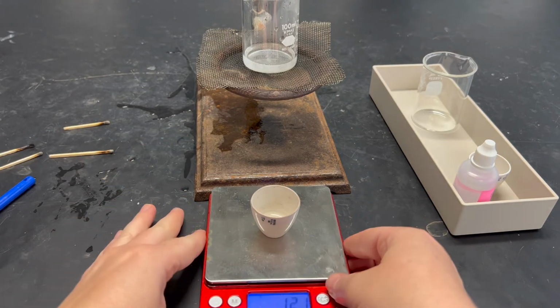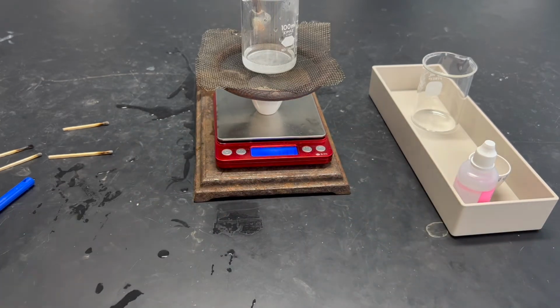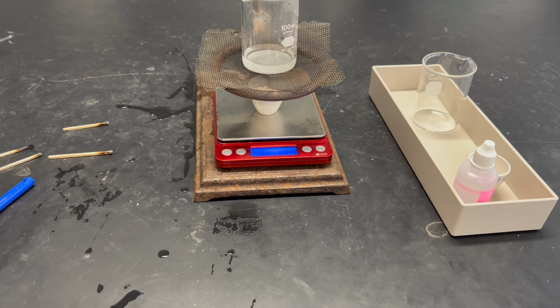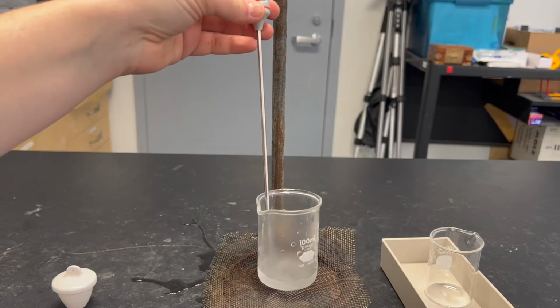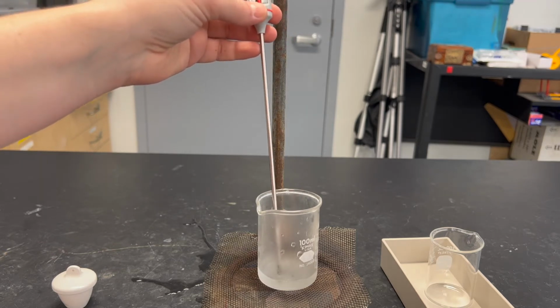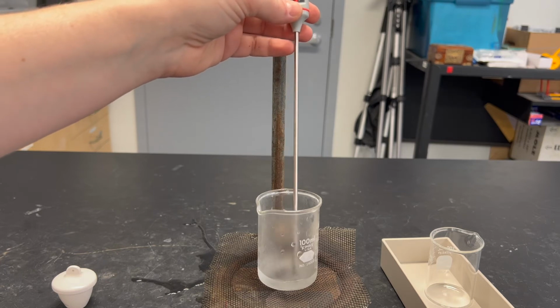And I can see my numbers are changing, so I'm going to quickly, carefully pick up my scale and slide it under my beaker, and I can see my beaker is starting to heat up, and now you can take temperature data. And now you're taking the temperature as it's warming the water up and watching the scale numbers drop, and you're looking for a max temperature. This should take you a few minutes.